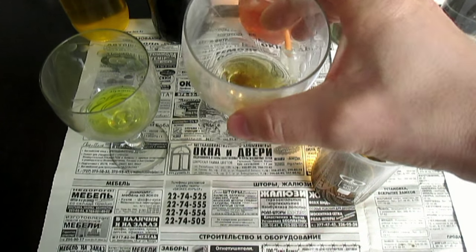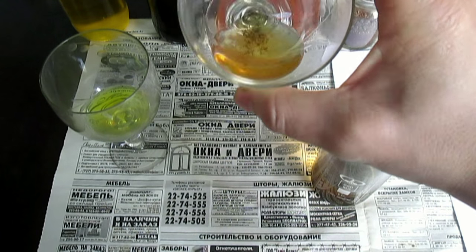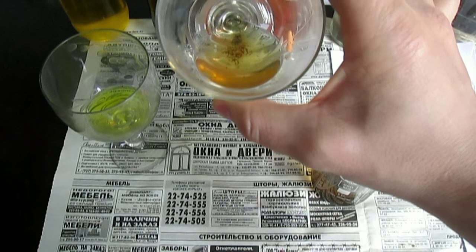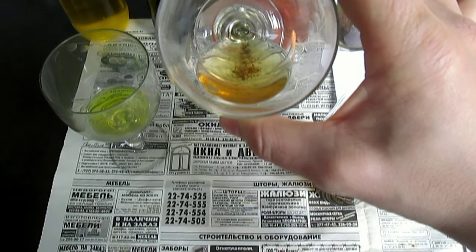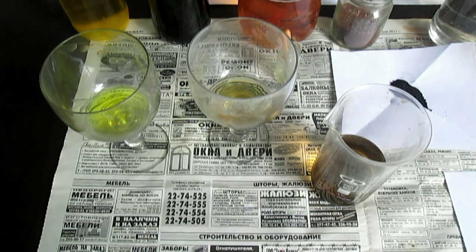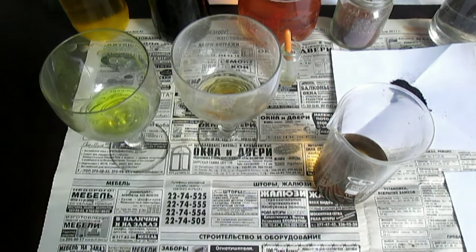Прошёл где-то час времени. Золото почти всё растворилось. На этот раз почему-то более медленно растворяется шелуха золотая. Я вообще тестировал вне съёмок — у меня она за 15–20 минут растворялась. Может, слой был толще золота на деталях. Видите, уже почти всё растворилось. А раствор почти не изменился в цвете, как я и говорил — золото, которое растворяется в этом растворе, получается прозрачного цвета. Это суперреагент окрашивает раствор в такой немного бордовый цвет.